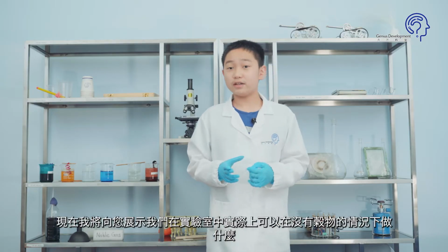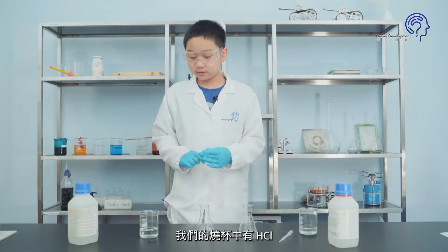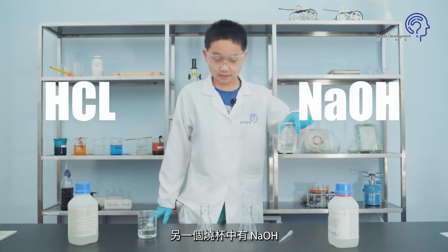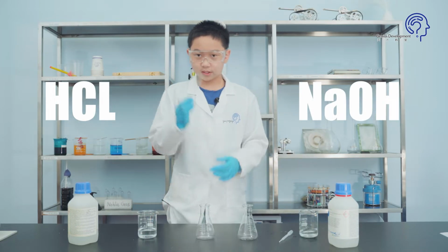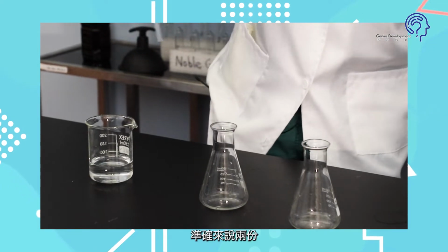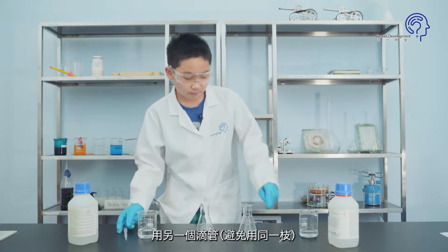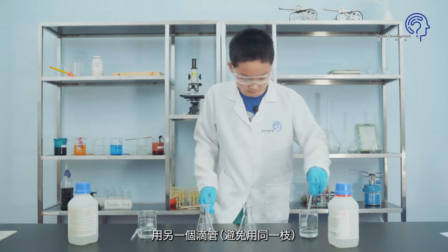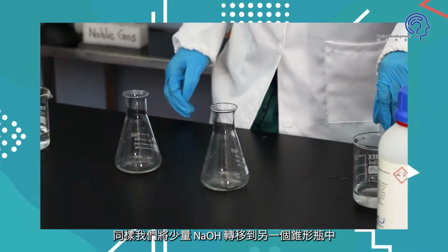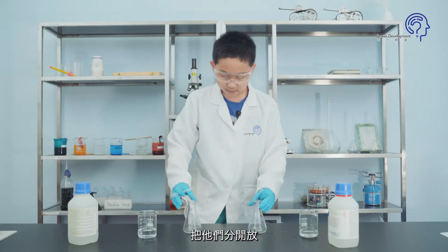Now let me show you what we can actually do in a lab without cereal. Alright, so now we have HCl in this beaker and NaOH in this one. So with this dropper, I'm going to get some HCl. To be precise, 2 squirts. And using a different dropper for many reasons, we're going to put this one into here. But we do it twice. So we're going to keep them separate.